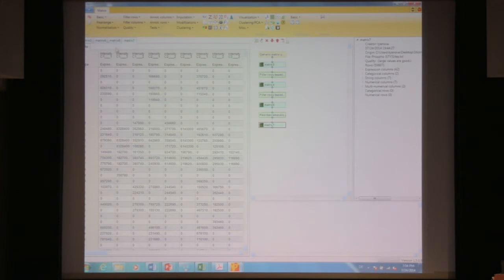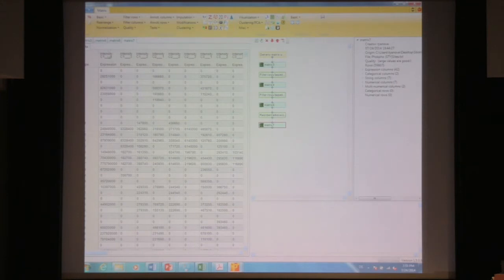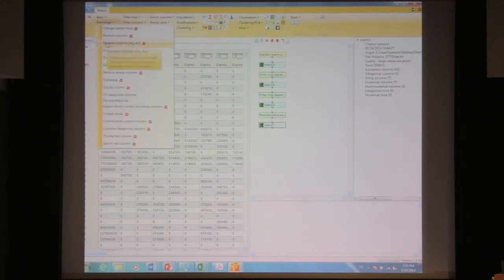So now, the same as yesterday, also for cosmetic reasons, we may want to rename the columns here. They're not so nice looking. So let's go rearrange, rename columns with regex.